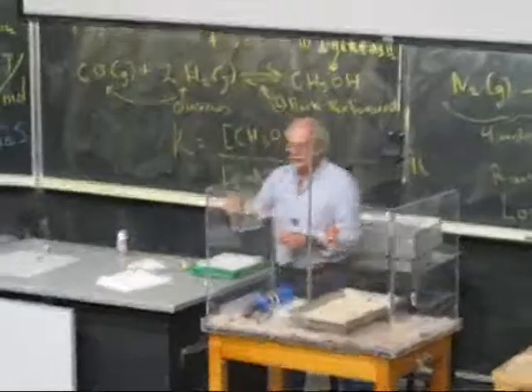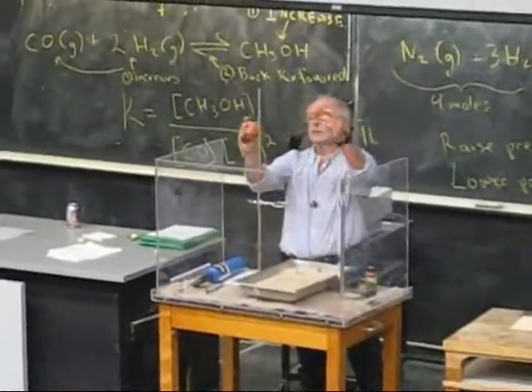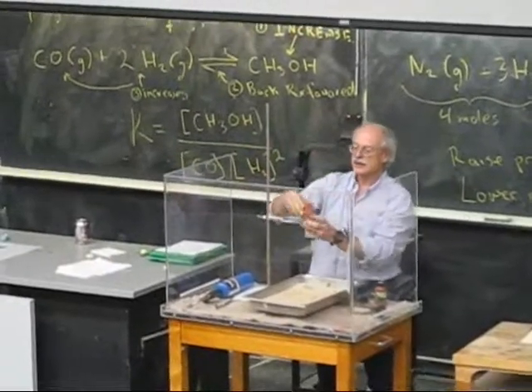So here's the thermite, which is that rust of iron oxide mixed together with aluminum powder. And here we have just two little cover pots.